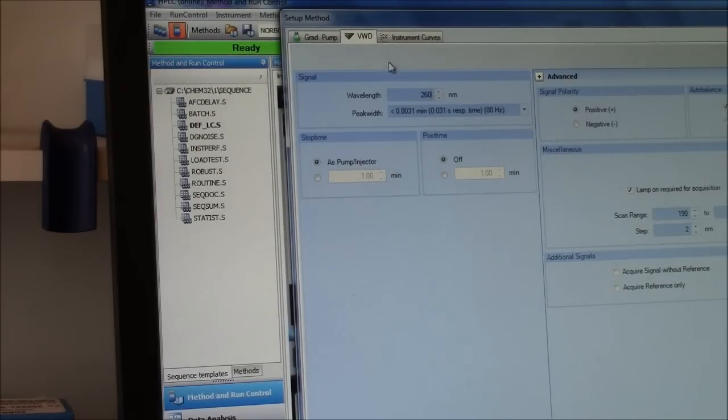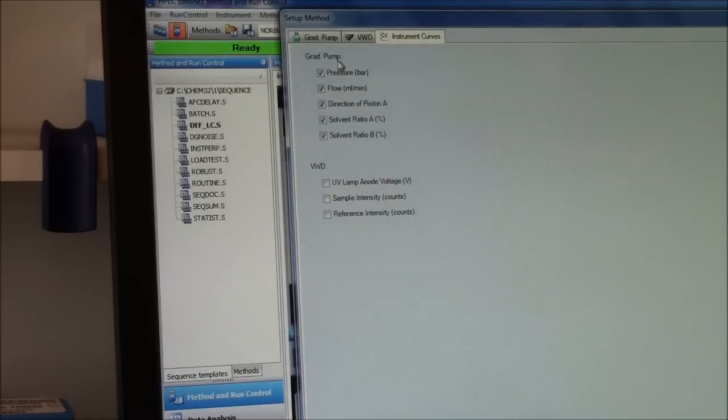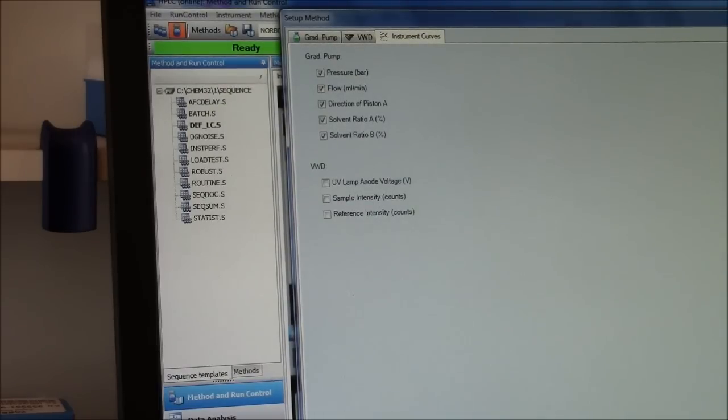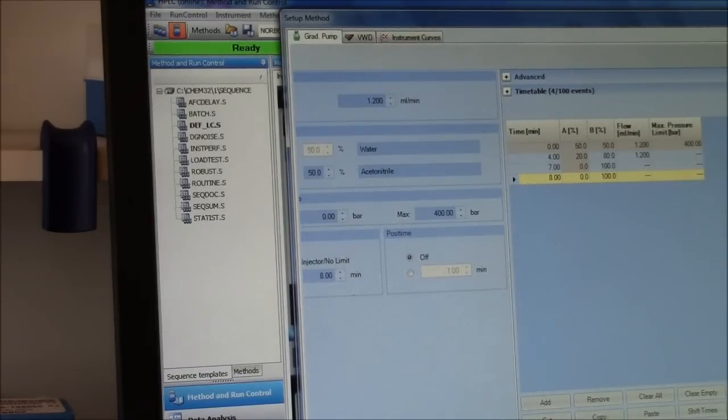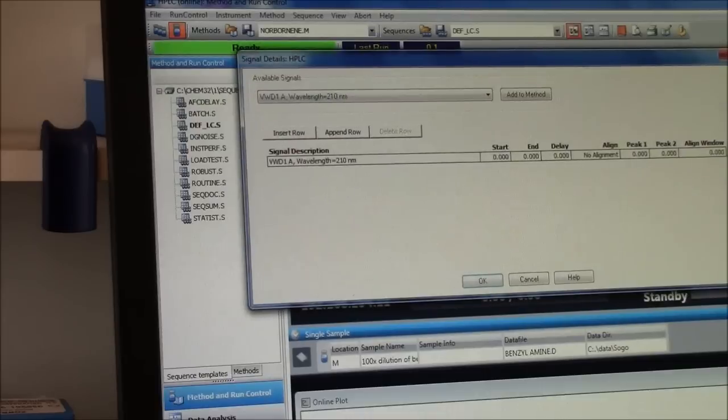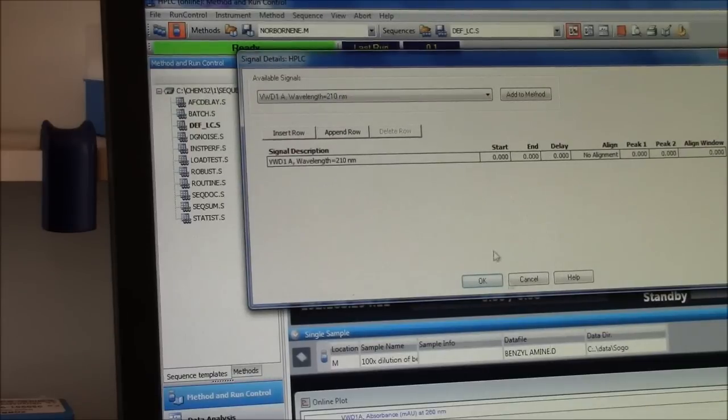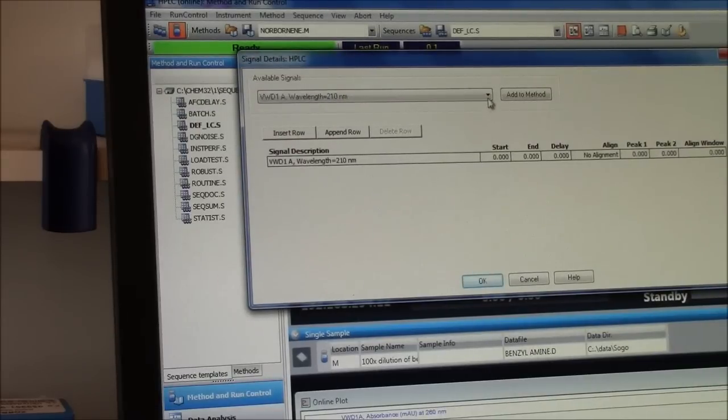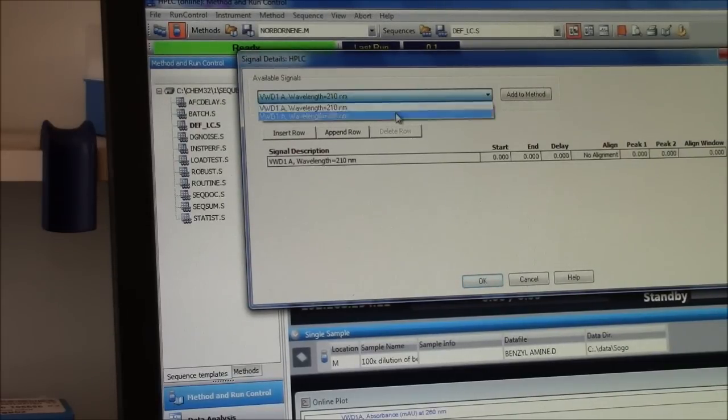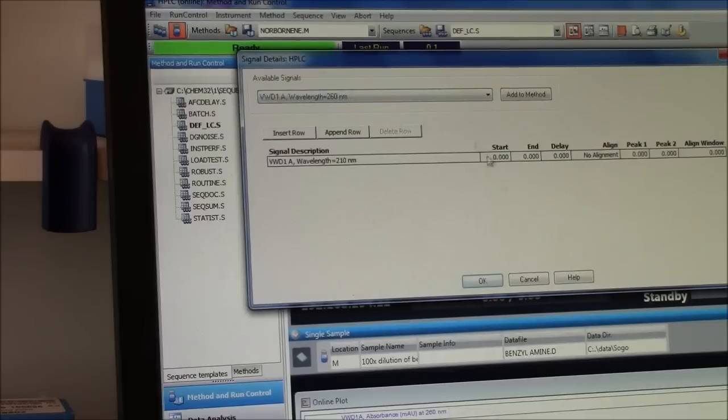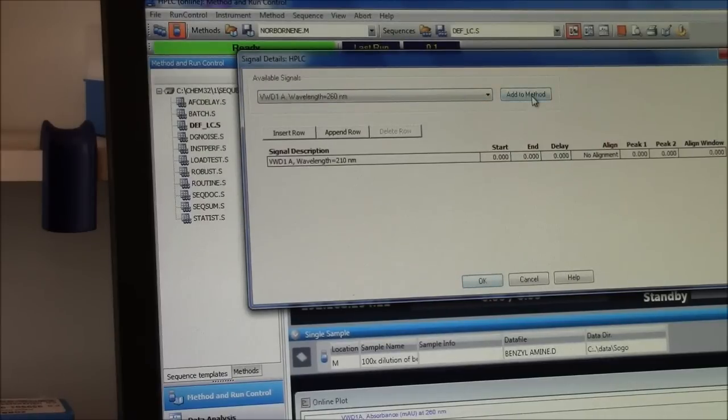That looks good. So I have everything set up the way I want. Now, it says what wavelength you want to use. I want to use my 260 nanometer wavelength. Add that to the method.